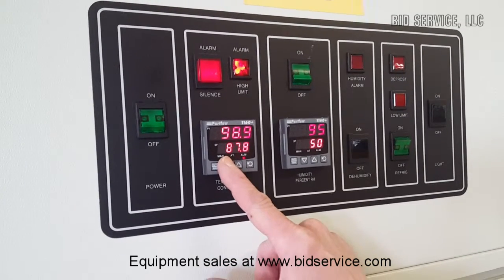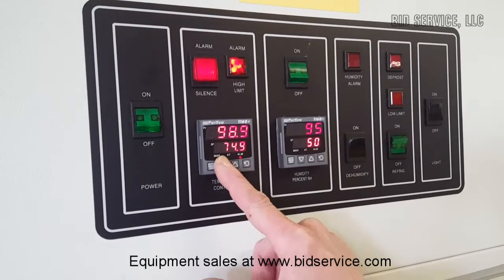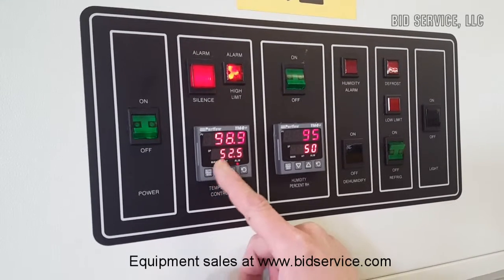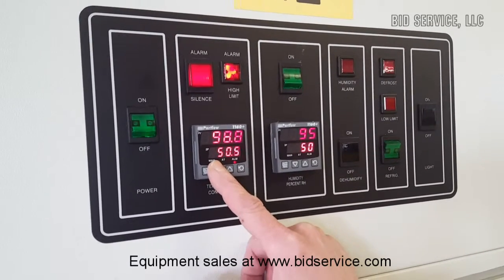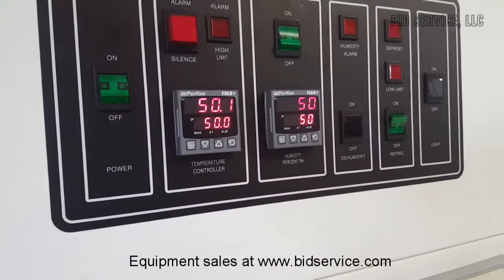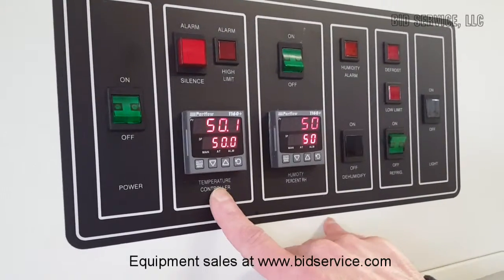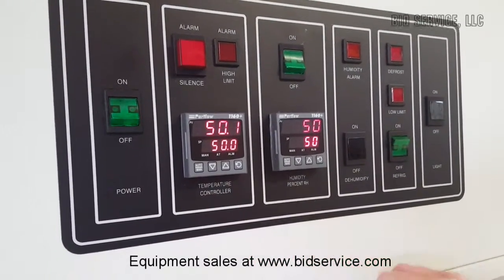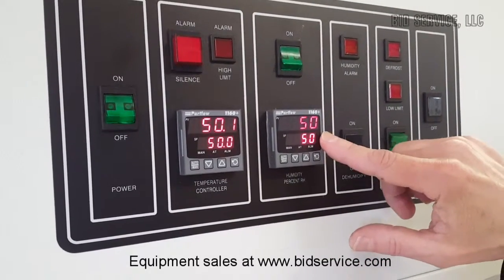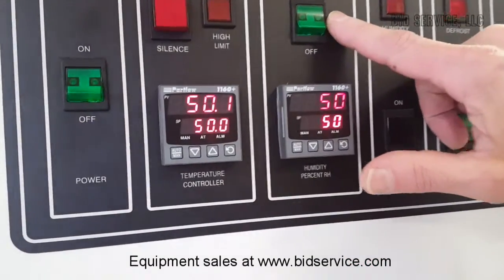Let's bring this down to 50. We'll come back in a few minutes and take a look at it. Now we're maintaining at 50 degrees Celsius and 50% relative humidity. You can see that the power output from the temperature controller to the boiler is flashing — it flashes simultaneously with the light here.